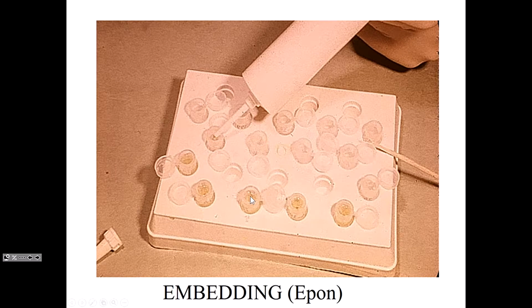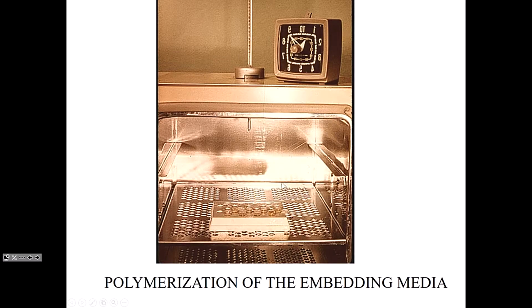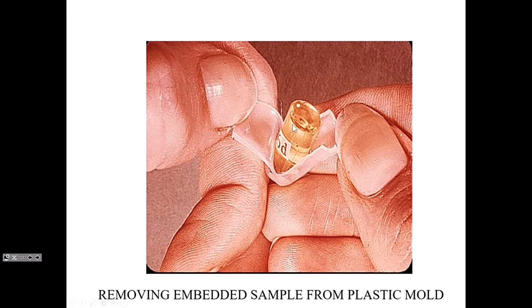And then you mix these 2 tubes of stuff together, and in 5 minutes or sometimes 30 minutes, it will turn rock hard. It acts as a glue. It's the same stuff, EPON. So this EPON, which is liquid, then impregnates into the tissue, and then we put it in an oven overnight, and when we do that, it turns rock hard, like so.